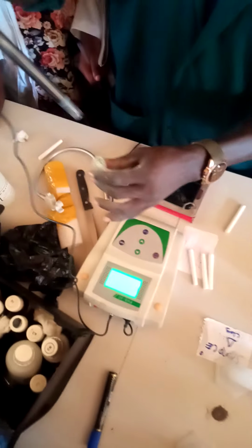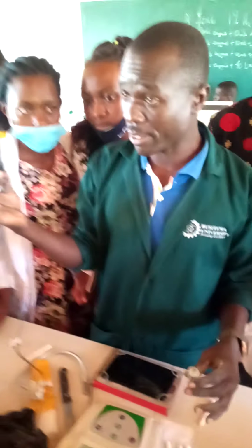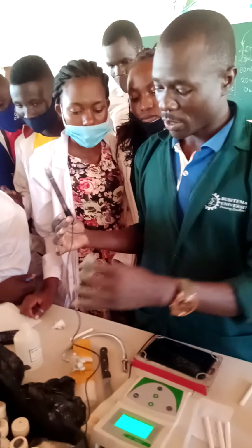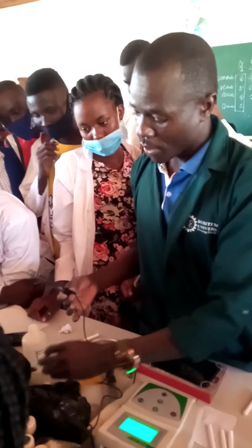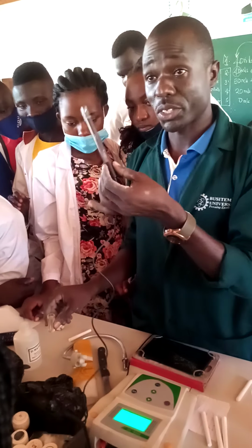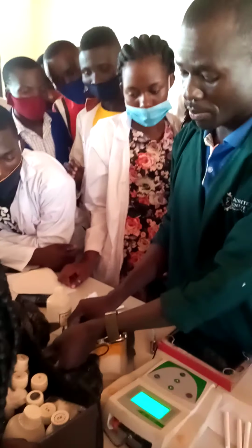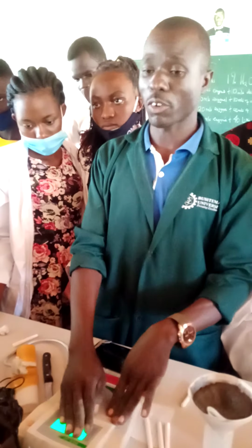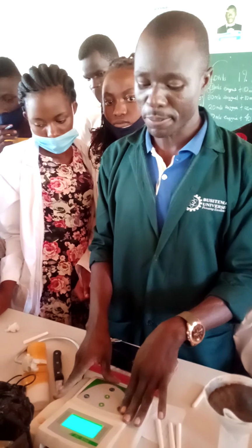It will continue counting until it goes up to 7, because this water is what? Neutral. Now, if you have water which is neutral, the sensor always has to be inside that neutral water, so that you can start reading the pH from neutral, to either fall to acidic or fall to alkalinity.